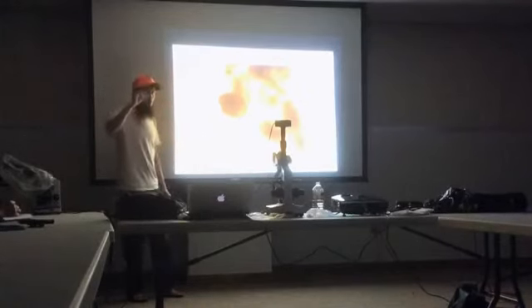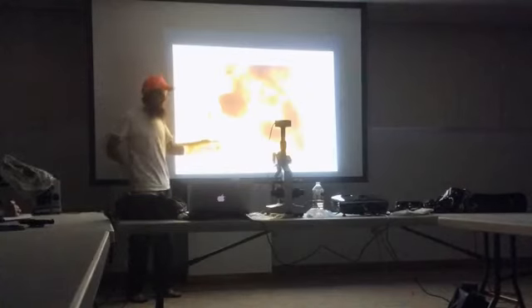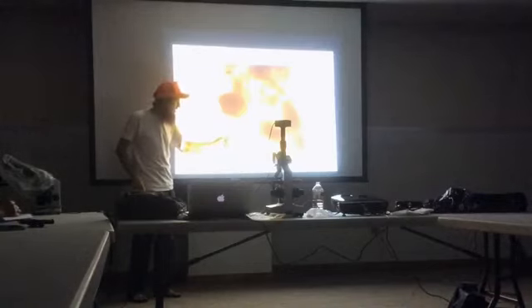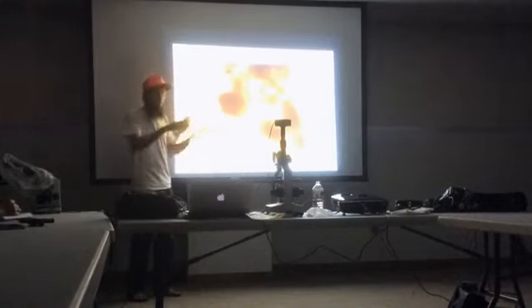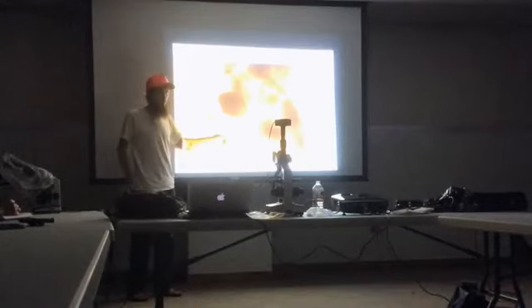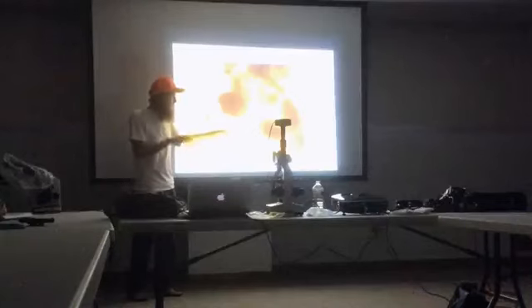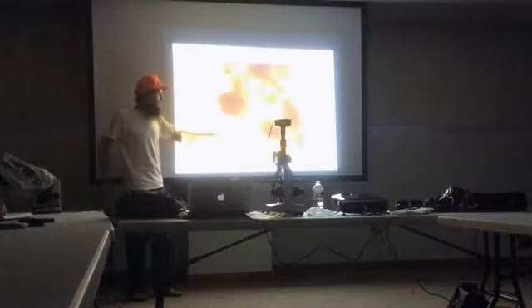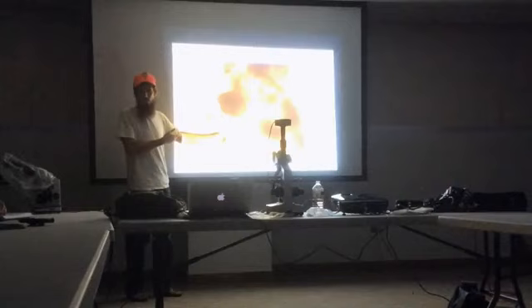I'm going to assume that that's 1 micrometer in length, because bacteria are typically about that size. And so you see how it's dancing around out there. You could take maybe 3 or 4 of those and put them side by side across here, like 1, 2, 3, 4. And that would be the width of this fungus, right? So you can see how 4 of those would fit across. So that gives me a scale to know that this fungus is at least greater than 3.5 micrometers. So I would say that this is definitely a beneficial fungus.